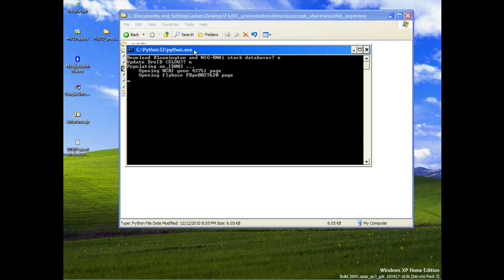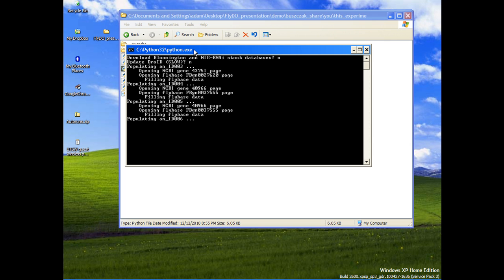And you can see it's telling you what it's doing, so that way you can see if it has an error, it'll spit out an error report and say something bad happened. Mostly it should work fine. So you can see it's looking at NCBI and collecting some information from there, which is stuff that's not being put on this right now, and also Flybase. And there's only 4 of these I think we did, right? So this will only take a moment. You can see it takes about this long for each one. So if you've got 200 of these, it'll take a while.